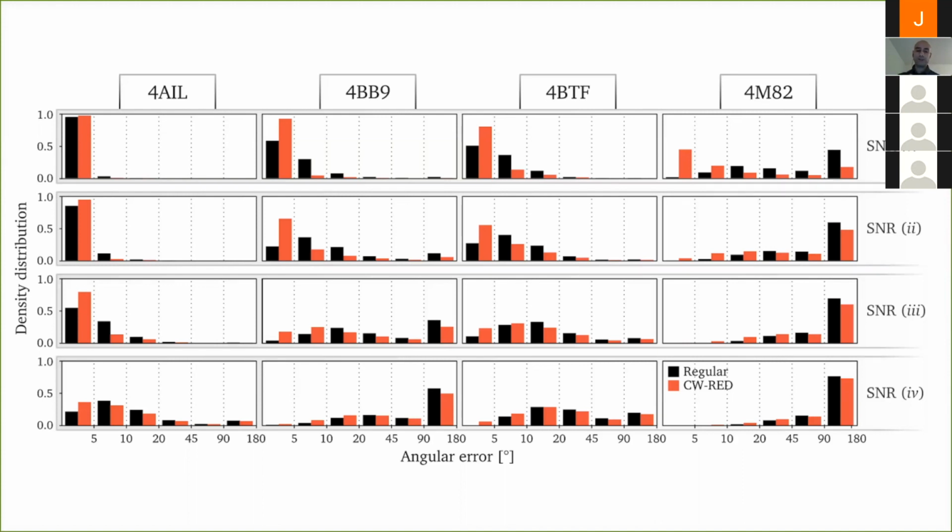It's about iteratively, at each step in your reconstruction, improving things in a way so that your angles become better, so that you can align your projection images better. And once you do that, once your angles are actually getting better, then you're actually putting something in there that helps the reconstruction along the line. So, it reduces the risk of creating something that isn't there.